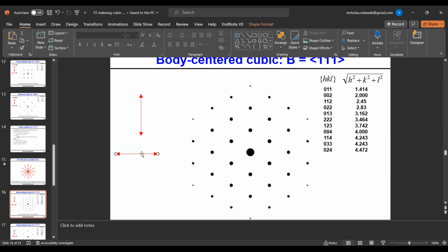I also tend to try and arrange them so G2 cross G1 gives us B, but you don't have to do that, strictly speaking. So if we're going to do that, just for the sake of argument, I'm going to call this guy G1 right here.